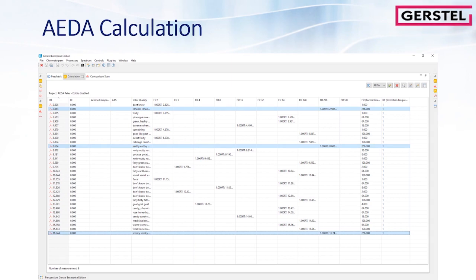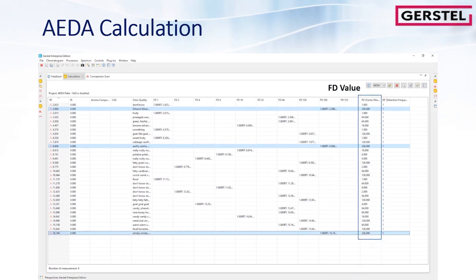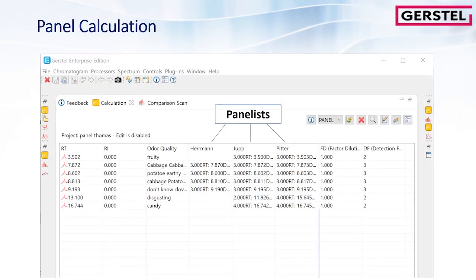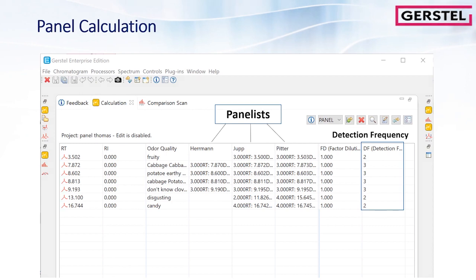Basically, you do GCO runs of a dilution series, with each step diluted by a factor of two. The compounds which are still present in the lowest dilution have the highest dilution factor. In the drop-down list, you can see there is a panel algorithm available. This is very similar, but you do not look at dilutions, but at the number of panelists that are able to detect the aroma active compounds. This number is then called detection frequency and will be calculated for each GCO peak from the panel data. This is related to the SNIF technique, the Surface of Nasal Impact Frequency.